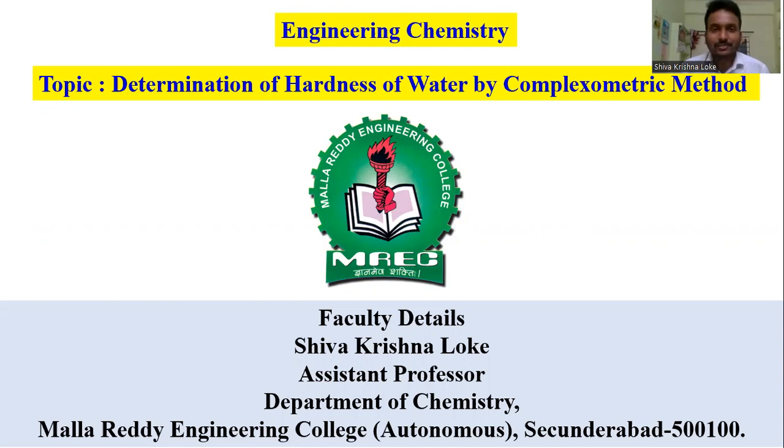In today's session, I'm going to teach you the topic called Determination of Hardness of Water by Complexometric Method. So today my presentation flow will be like this. First, I will discuss the definition of hardness, the principle involved in this titration method, and the calculations regarding the hardness of water by complexometric titration method.